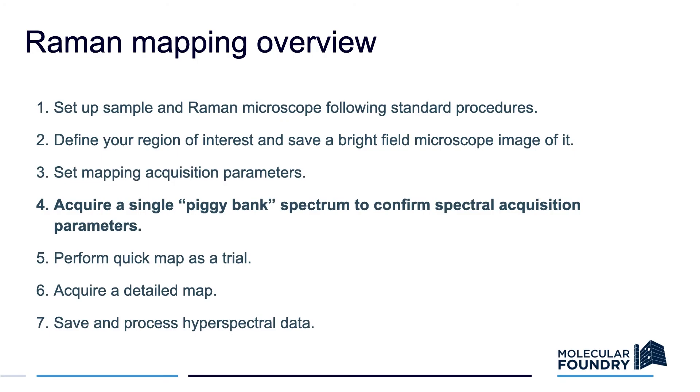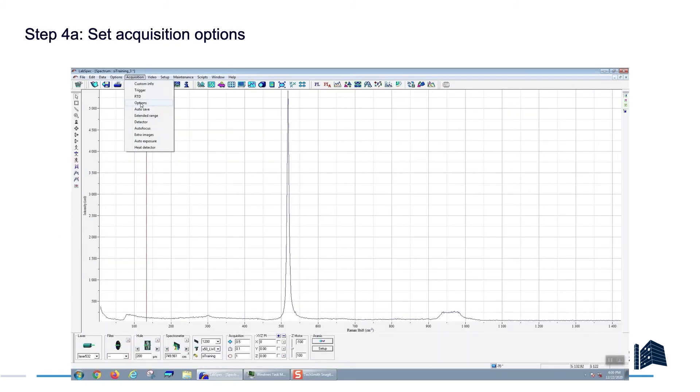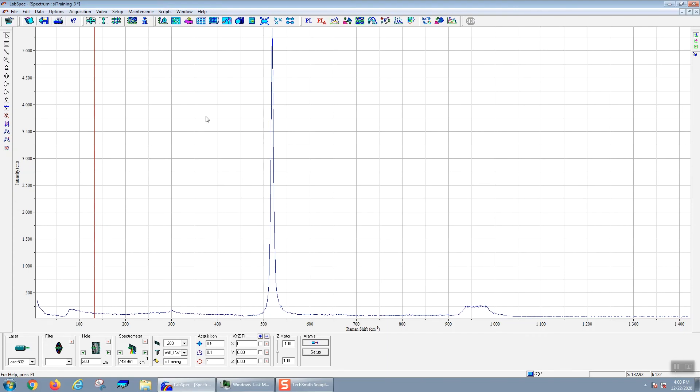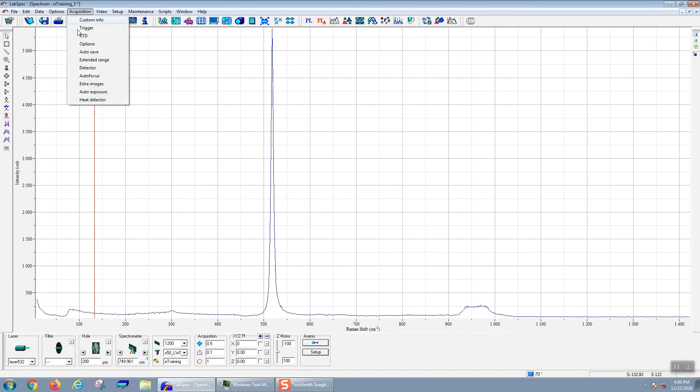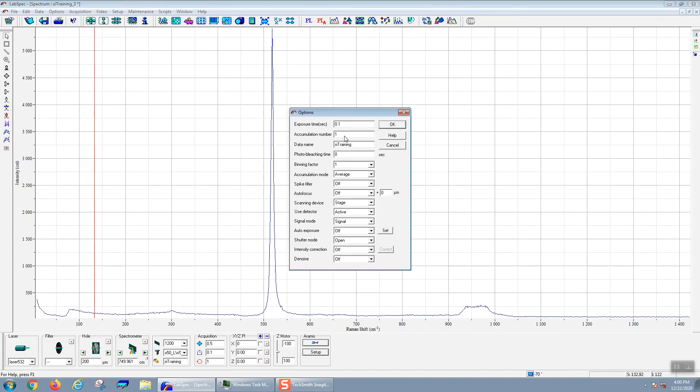After setting the mapping acquisition parameters, we now need to set the spectral acquisition parameters and take a piggy bank spectrum just to confirm them. First we'll set the acquisition options. We'll go to acquisition menu and then options. Here the most important option to set is to set the shutter to always be open. This is because you can waste a lot of time opening and closing the shutter for every pixel.